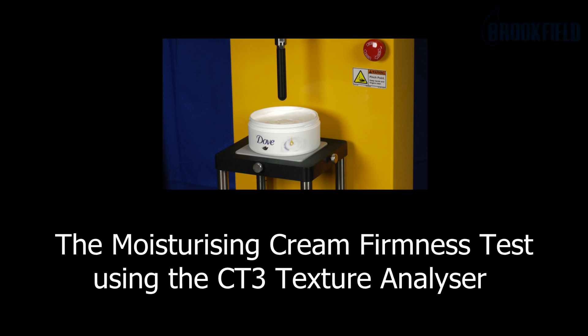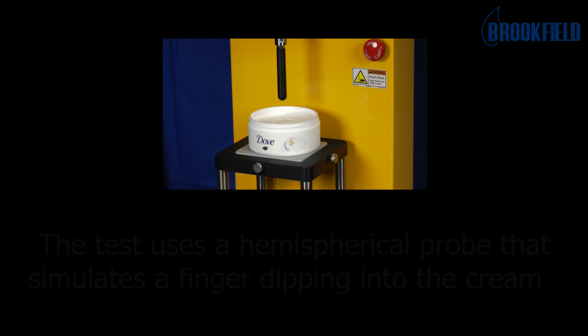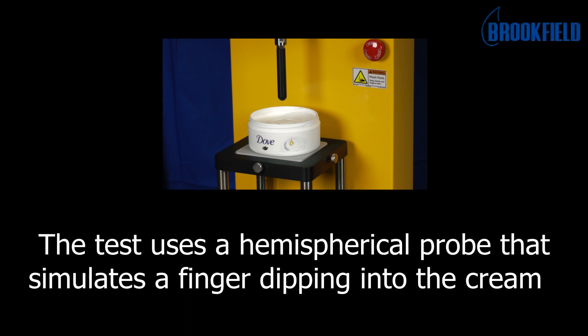This is the Moisturizing Cream Firmness Test using the CT3 Texture Analyzer. This test uses a hemispherical probe that simulates a finger dipping into the cream.